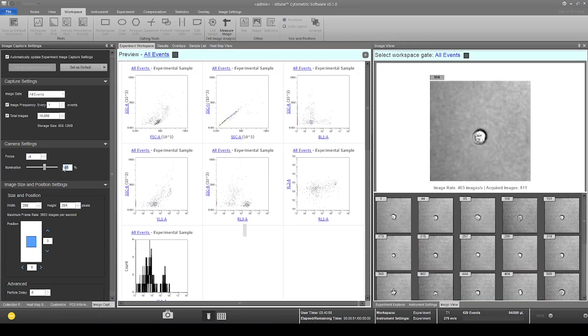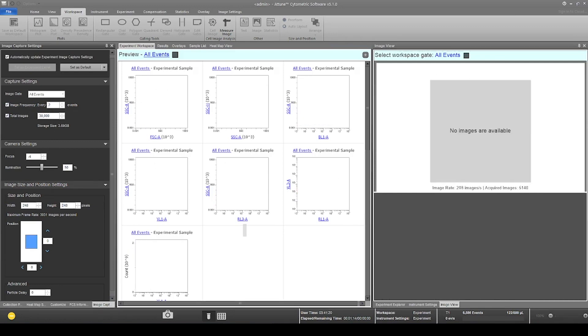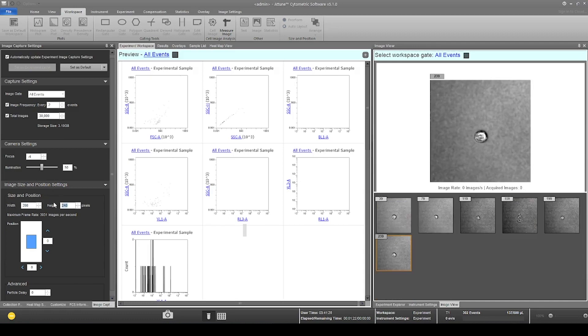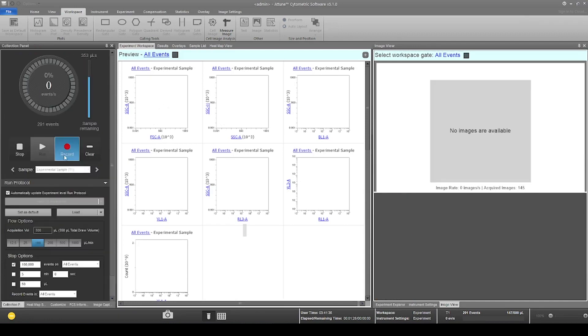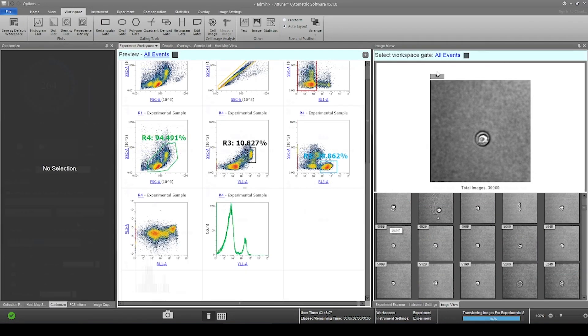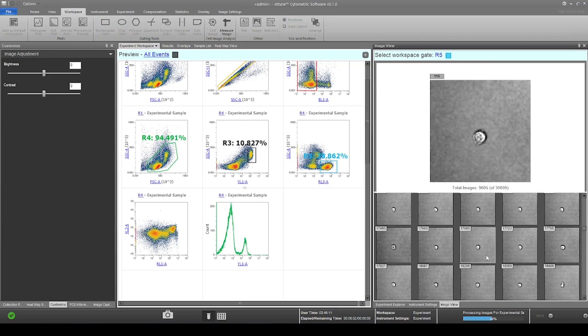As the plots populate, you might need to adjust the focus and illumination. As data is collected, you may visually confirm events are of interest by using the Image View panel to distinguish cells of interest from debris.